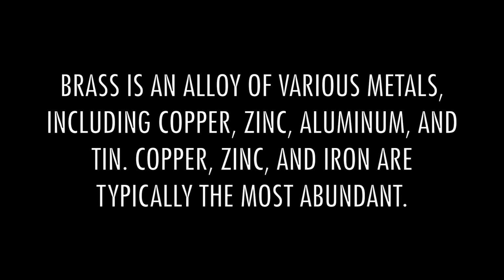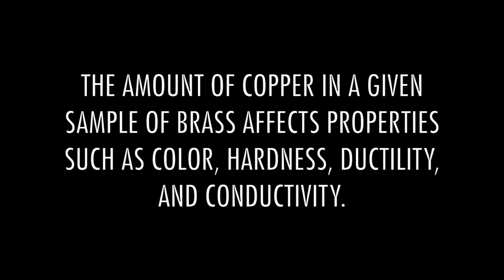Brass is an alloy of various metals, including copper, zinc, aluminum, and tin. Copper, zinc, and iron are typically the most abundant. The amount of copper in a given sample of brass affects properties such as color, hardness, ductility, and conductivity.